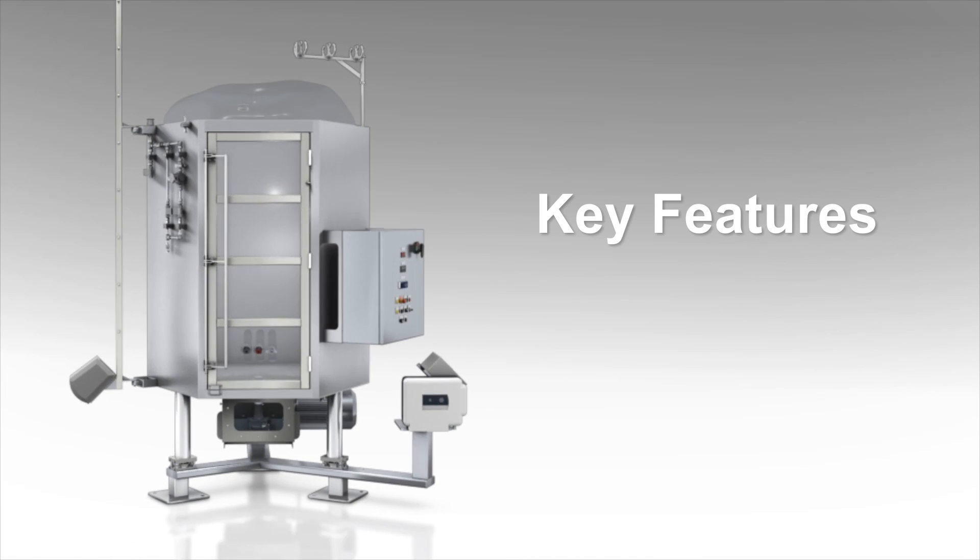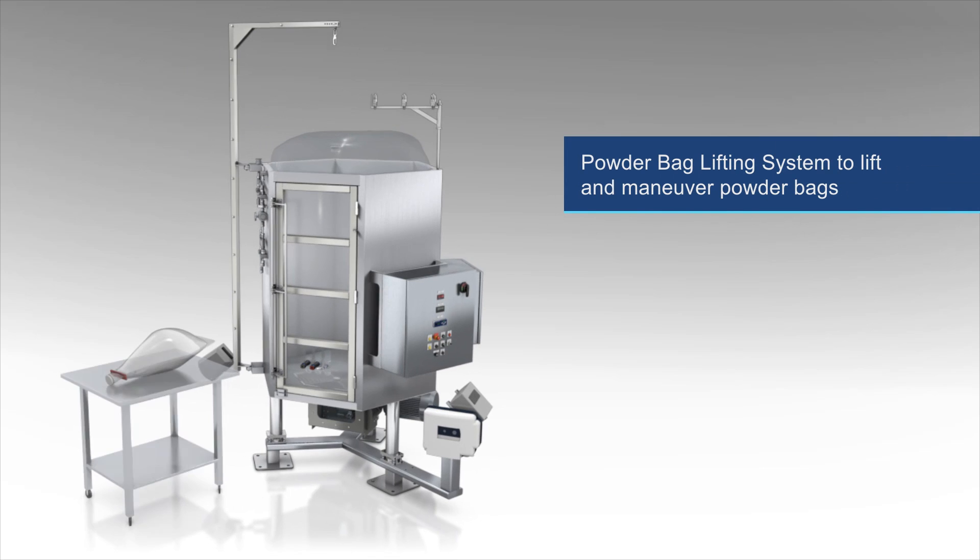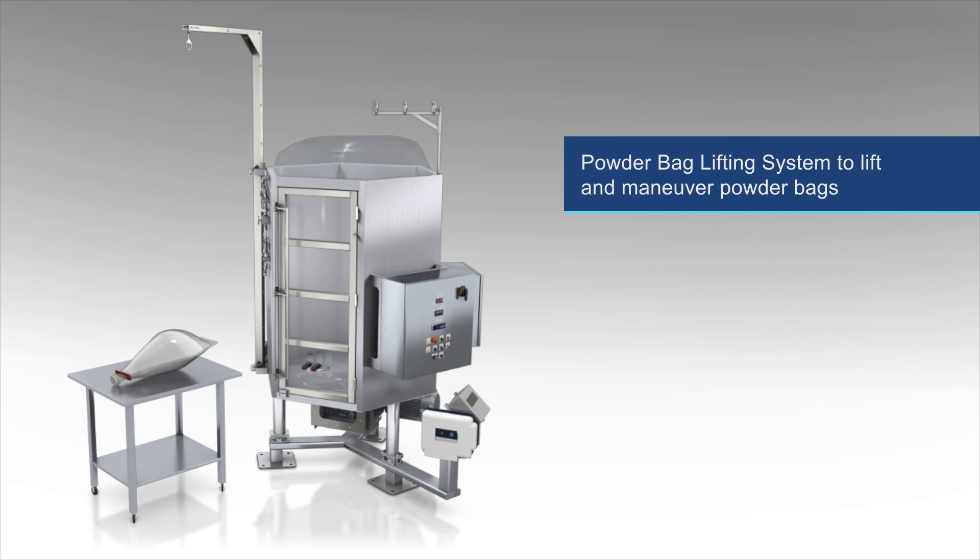Some of the key features of the Impulse single-use mixing system include a powder bag lifting system with jib crane and manual or power winch to easily lift and maneuver powder bags.